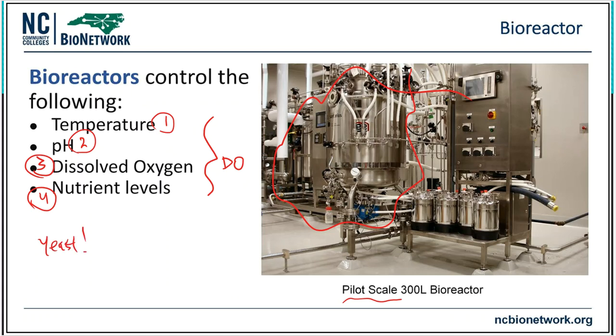Oh my gosh, guess what? That yeast is a biological molecule. That's what that thing is, right? It's alive. Okay, so that yeast is going to do a job. And I need to make sure that yeast stays active and it stays alive and it has the nutrients that it needs. That means that the process of making moonshine is very much like a bioreactor, and it's a bioprocessing technique. That's what this is.